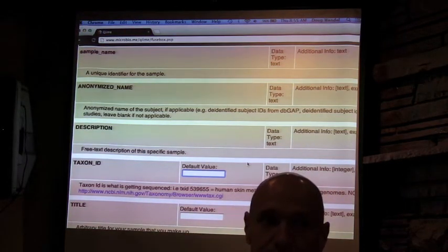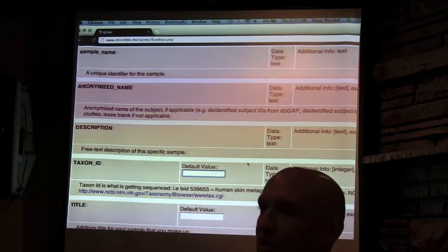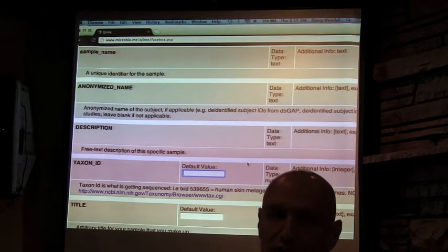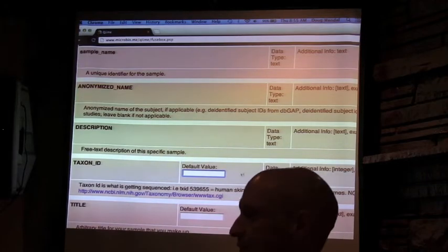This is just building what you want to put in. It's not really putting in all your values. That is correct. You can pre-fill a lot of this stuff, but this is just generating templates that you are then responsible for filling out. Oh, yeah. Good question, though.